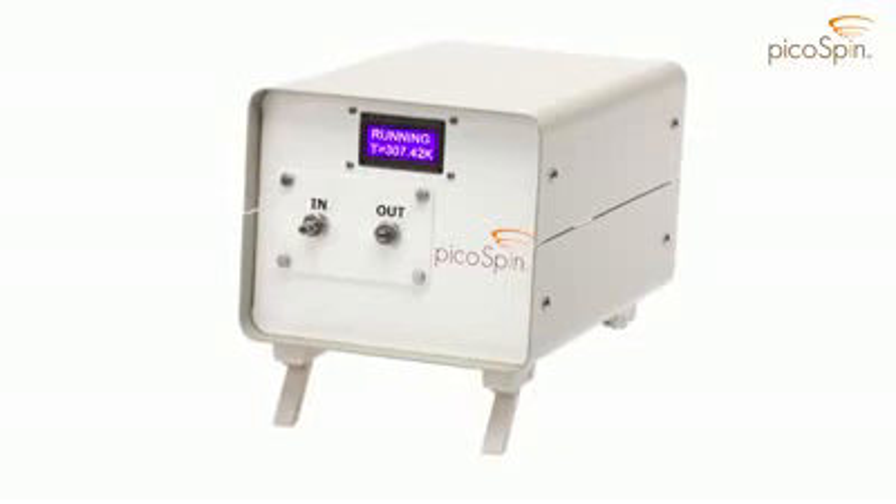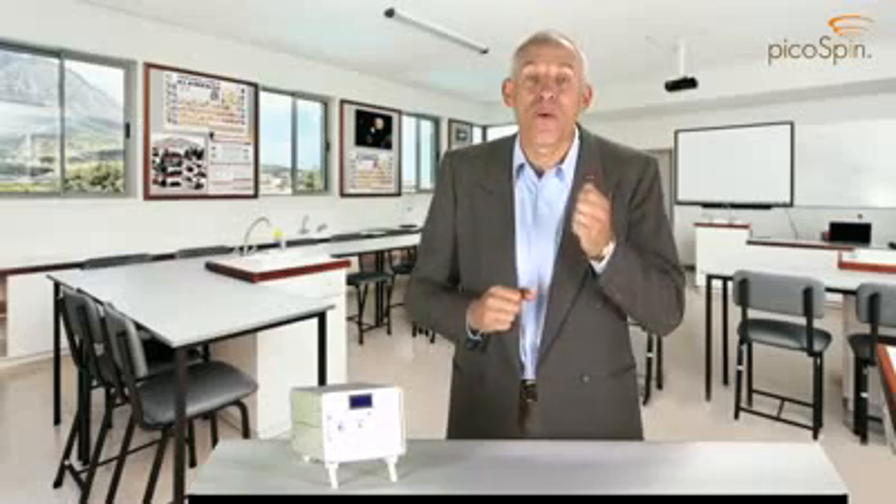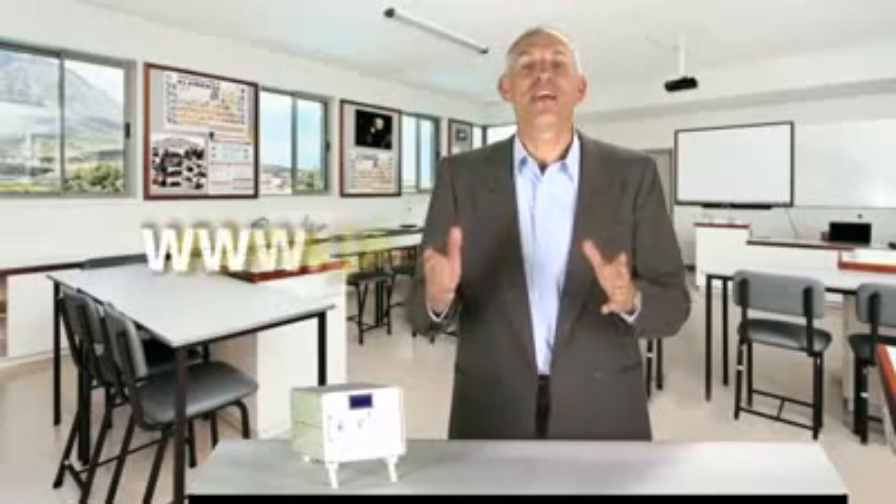As you can see, the PicoSpin45 is truly revolutionary. It is compact, affordable, rugged, easy to use, and a true spectrometer. It will engage and inform your students while teaching them about the most important and powerful analytical tool in chemistry, NMR spectroscopy. For more information about the PicoSpin45, please visit us on the web at picospin.com.